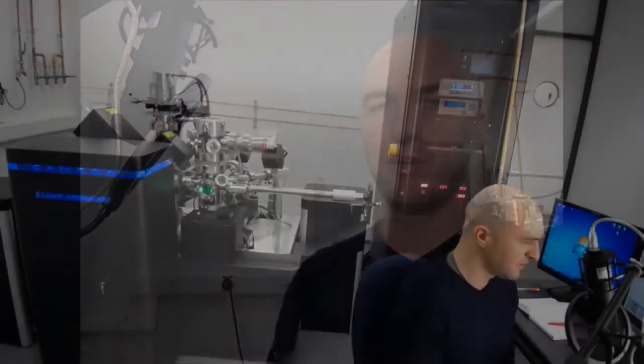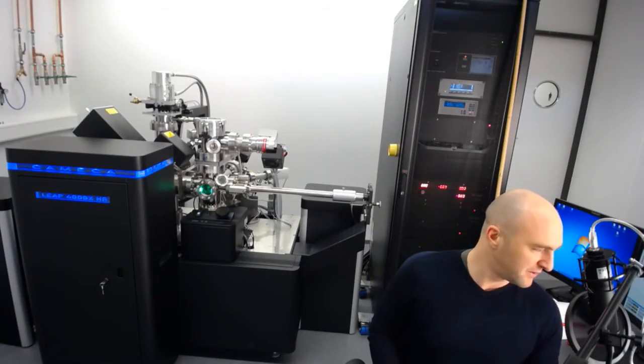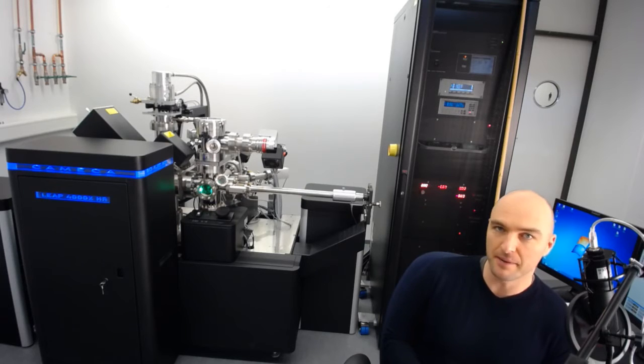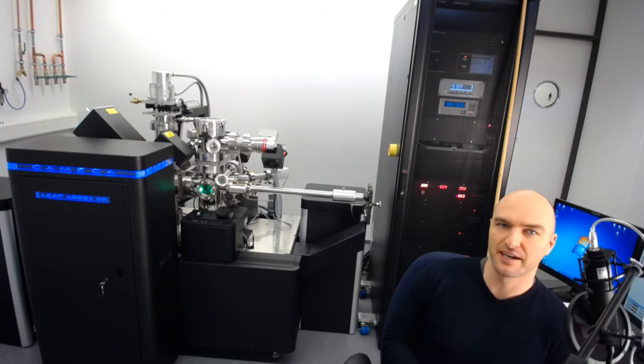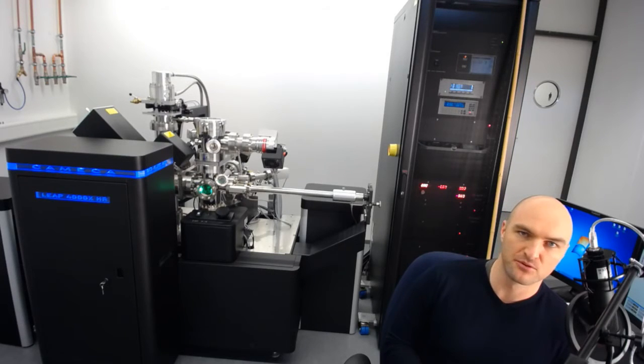Of course, if you're not in Erlangen, I still hope you'll find these videos useful. The Atom Probe I've got behind me is a Cameca LEAP 4000 XHR. If you've started doing Atom Probe work, you'll know what that means — it's a local electrode Atom Probe equipped with a UV laser, specifically a small-spot UV laser, in order to be able to measure non-conductive materials, semiconductors, and so on.